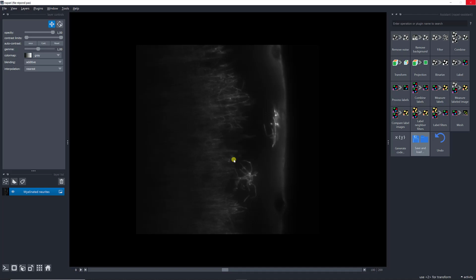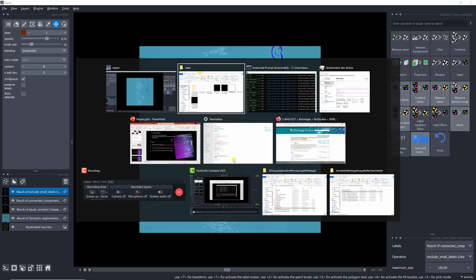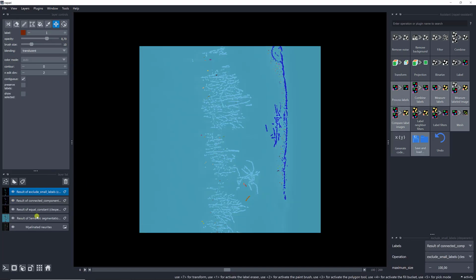So process the pipeline and should have what I got before. So it might take some time, but hopefully that should work. So you see, it's done.